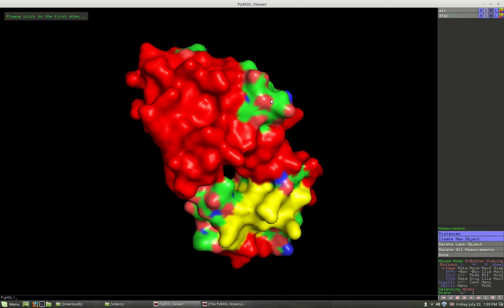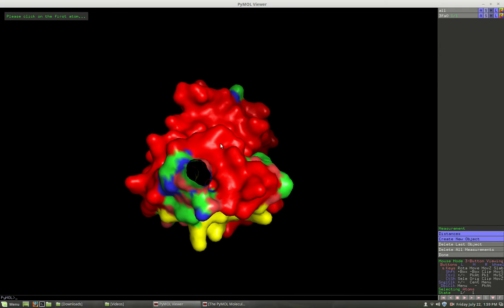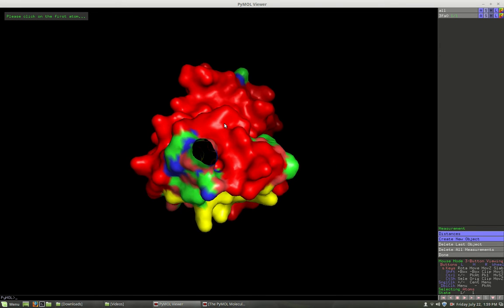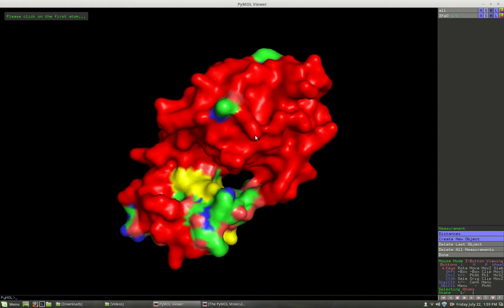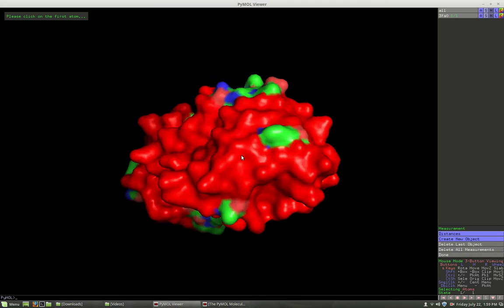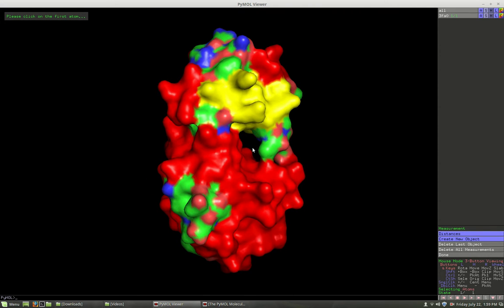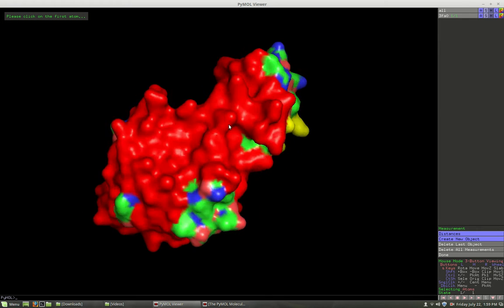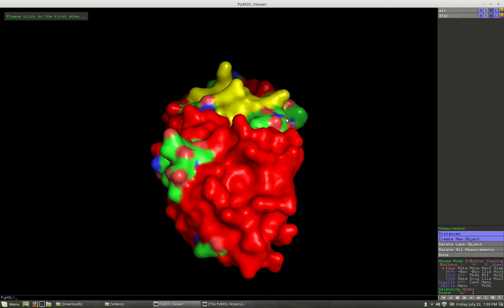Now it goes out on you if the image fades a little, use that middle mouse button, move it over a little so that it's in the range so that you don't get that happening much. Here we can move it. I still get a little of that. But as you can see, by the way, this was an interesting one. It has a hole in the middle of it, doesn't it? Kind of interesting.